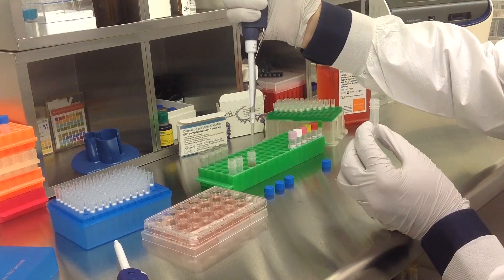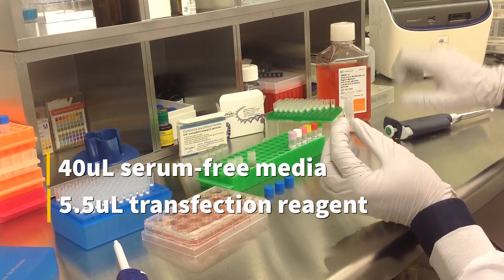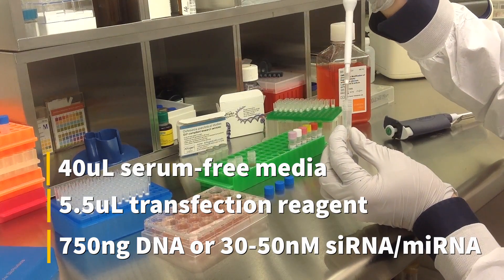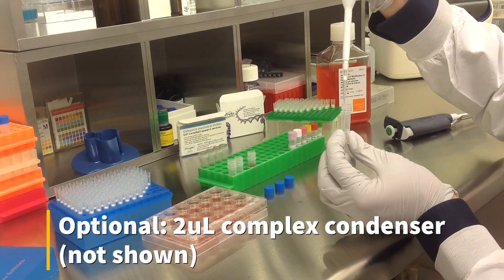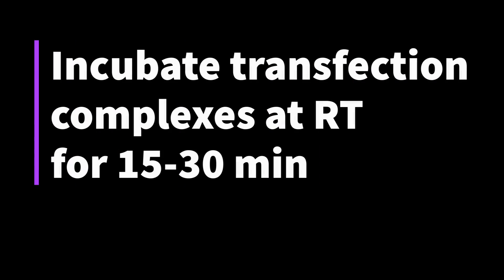To prepare the transfection complex, mix 40 microliters of serum-free medium, 5.5 microliters of transfection reagent, and either 750 nanograms of DNA or 30-50 nanomolar sRNA or microRNA. An optional step is to add 2 microliters of complex condenser, which increases transfection efficiency but may also increase cytotoxicity. Incubate the prepared transfection complexes at room temperature for 15 to 30 minutes.